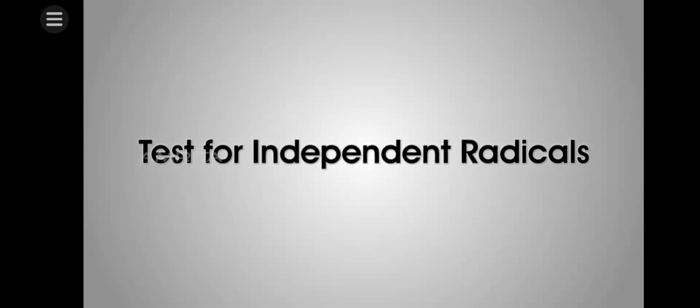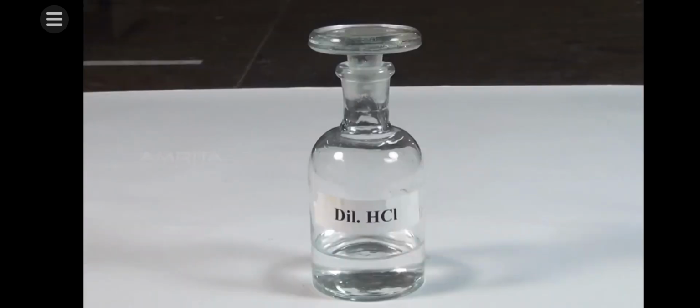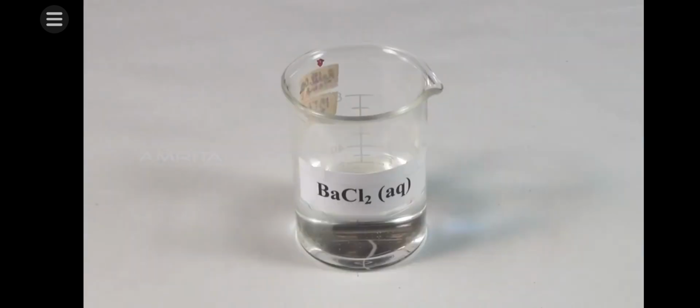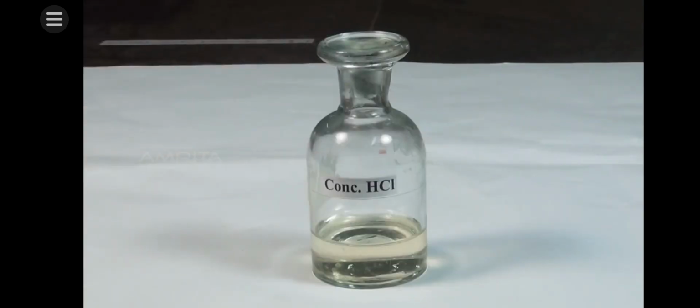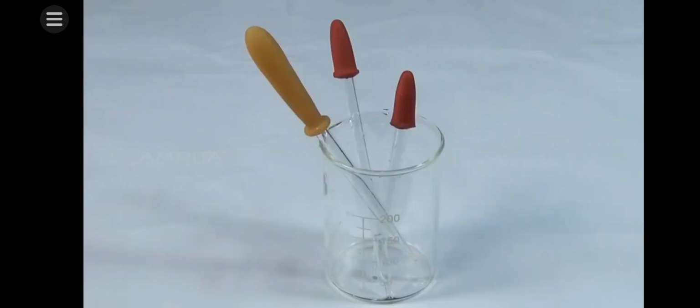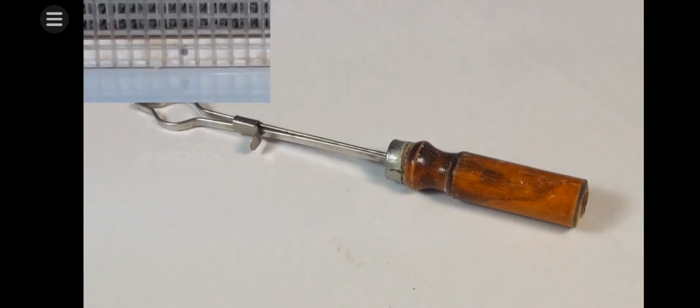Test for independent radicals. Materials required: original salt, dilute hydrochloric acid, barium chloride solution, concentrated hydrochloric acid, droppers, funnel, filter paper, test tubes, test tube holder and Bunsen burner.